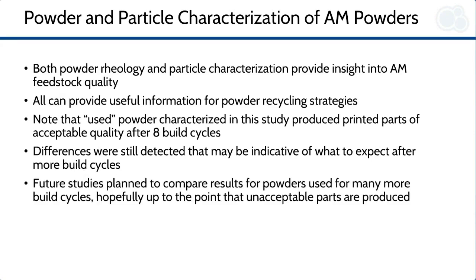Future studies are planned to learn what happens after many more printing cycles, hopefully up to the point where the used feedstock no longer produces parts that meet specifications. It is expected that these characterization methods, both for the powders as well as the particles that constitute the powder, will provide information that could be used to detect problems before unacceptable parts are made, saving time and energy and thus money.